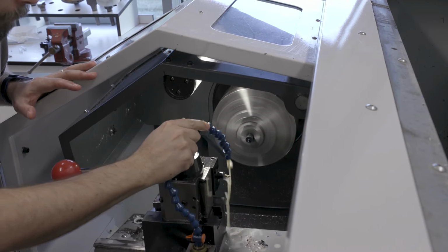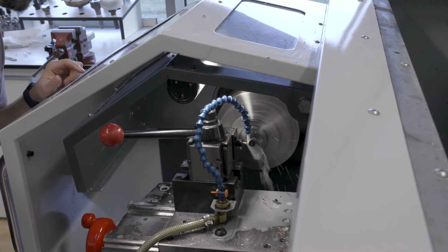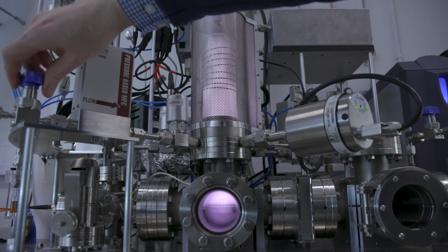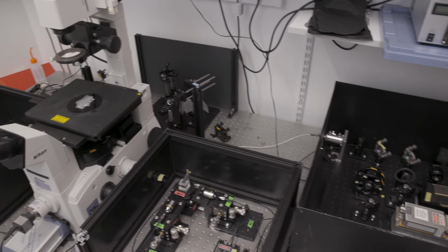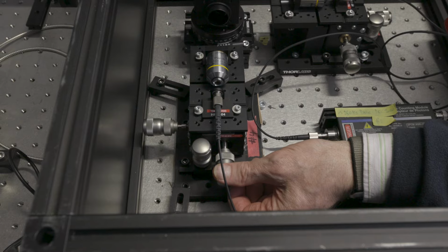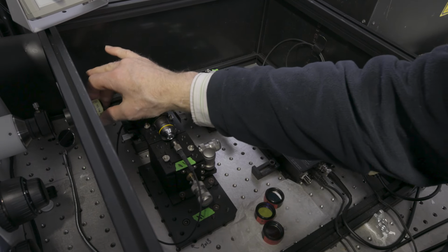I think most people that work in biophysics often use instruments and realize that probably the instrument could be optimized or bettered. And one of the unique things about working at the LMB is we have mechanical and electronics workshops that allow us to fulfill those desires to improve or build unique instruments. This is our single molecule spectroscopy setup that we put together here at the LMB. And we use this in two modes. One is to look at molecular diffusion, and we do that using a technique called fluorescence correlation spectroscopy. The other technique that we do is to use FRET, which examines distances between reporter groups in molecules.